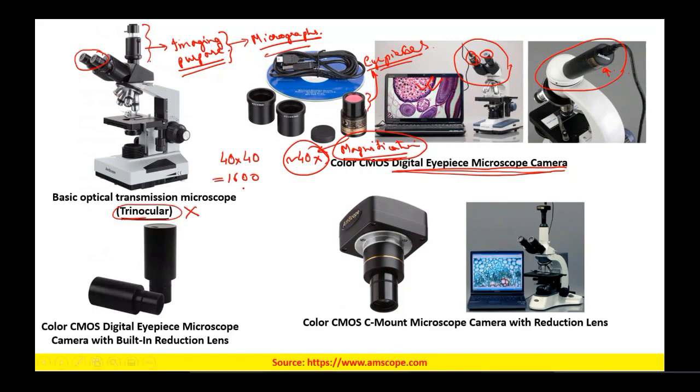Now you need to understand that when we increase the magnification like this, due to the limit of the glass optics, slowly your image will start to blur. Glass based optical systems may not be able to handle this kind of magnification. So the first thing you will get is a blurred image, and another important thing is that you will have a lower field of view.